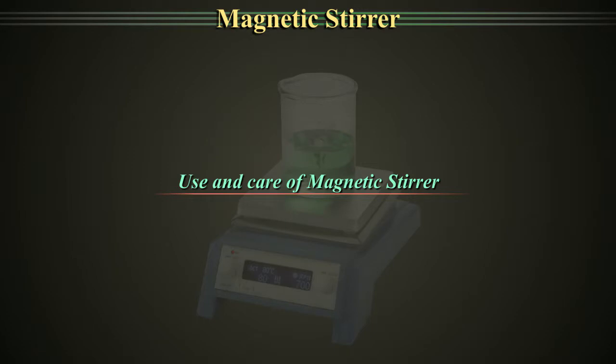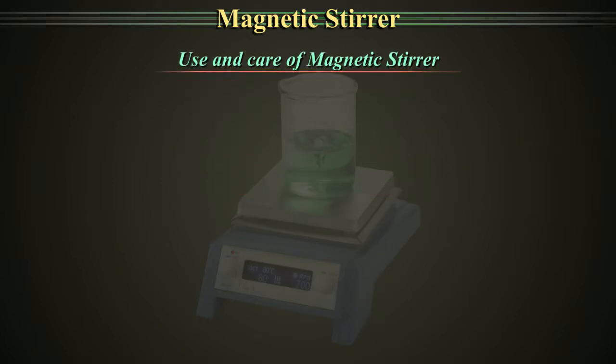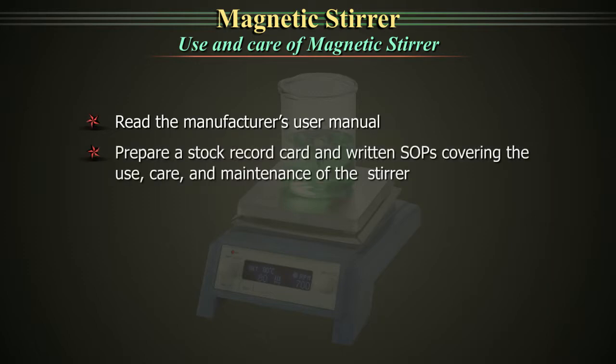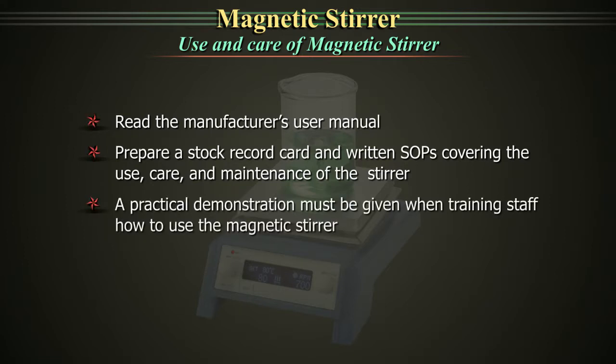Use and Care of Magnetic Stirrer. Read the manufacturer's user manual. Prepare a stock record card and written SOP covering the use, care and maintenance of the stirrer. A practical demonstration must be given when training staff how to use the magnetic stirrer.